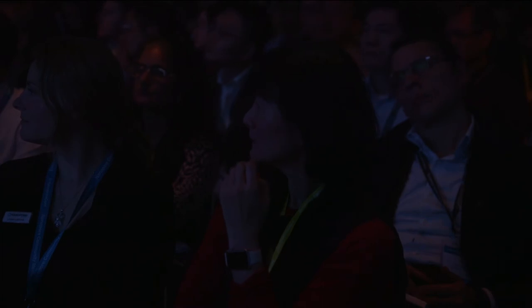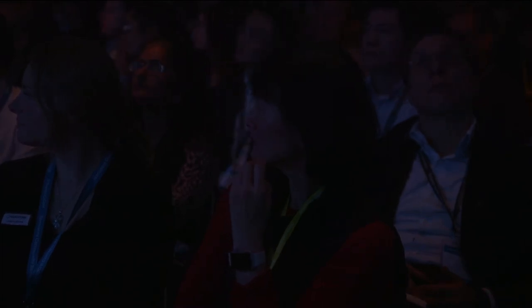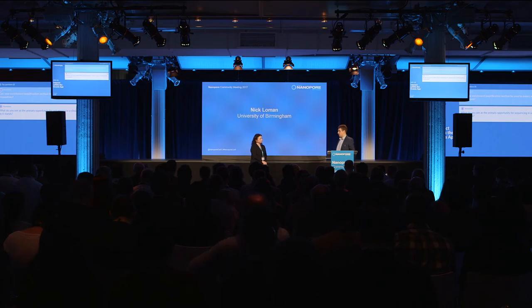Two questions there. One's easier than the other. I think you shouldn't have to sacrifice massive amounts of yield to do the ultra long reads. We can get reliably between 2.5 gig and 5 gig using the rapid kit, whether that's long reads or regular rapid reads. I think probably there is a ceiling there compared to the ligation kits where people do report 10 to 15 gigs, but actually in our hands we don't see a huge amount of difference there. Maybe a ligation library might give 6 or 7 in our hands, and maybe a rapid might typically give 3 to 4.